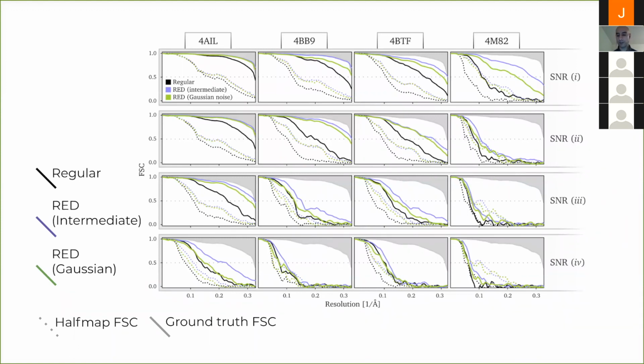You can apply convolutional neural networks, and I think that was the main reason people haven't done that in crystallography, where other methods might be more useful. But in cryo-EM, I think this type of approach will probably be superior to approaches where you handcraft ideas or priors about how things should look and adjust things. Yeah, I think that's my answer.